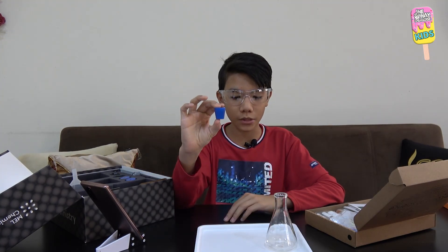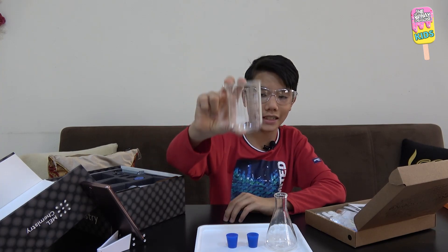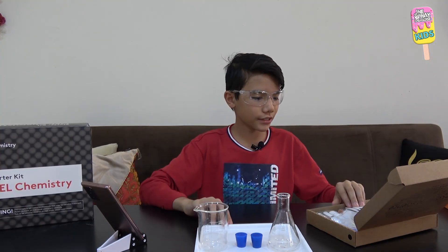We'll get the glass flask, safety glasses, plastic tray, a rubber stopper, a rubber stopper with one hole, and last but not least, the glass beaker. Now that the starter kit is out of the way, we're going to take some stuff from the actual set.